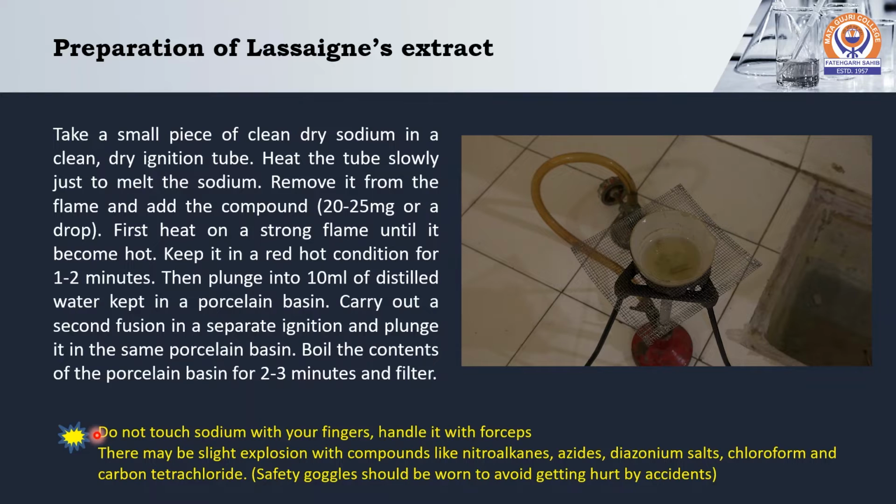So in this preparation, we have to be careful in handling sodium metal. We must wear safety goggles and lab coats while handling this preparation.